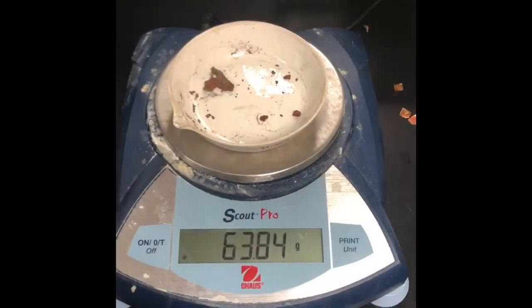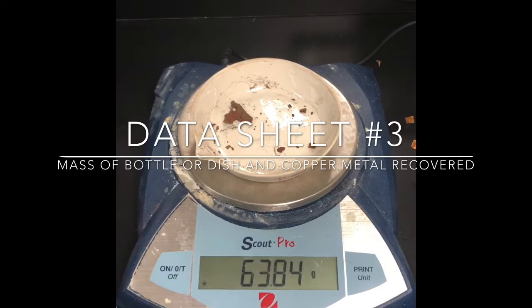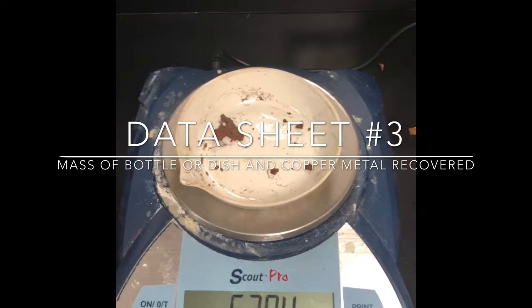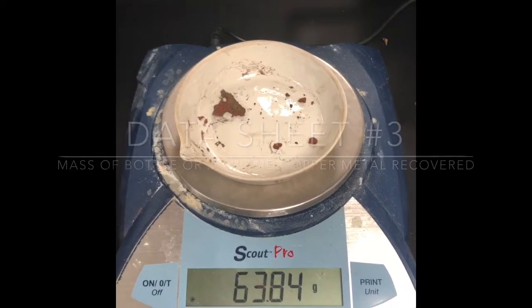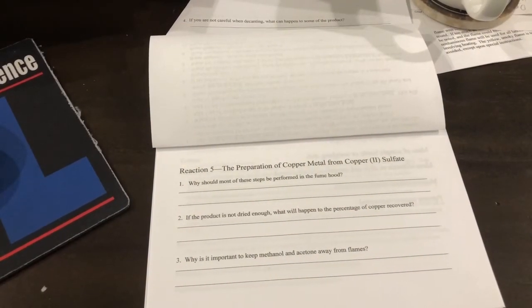Okay, so after getting our copper out of the oven and fishing out the boiling chips, we're going to say our final measurement of our mass of copper recovered is going to be 63.84 grams. Okay, so we're going to look at the preparation of copper metal from copper 2 sulfate. So this is going to be reaction number 5.